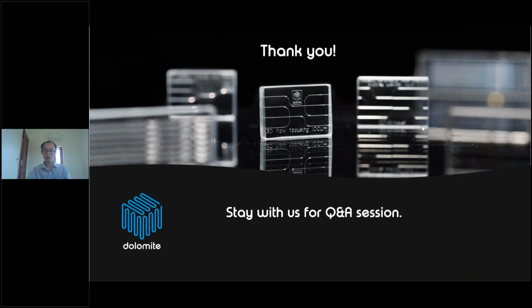Another last question I can see here is from Pretty as well. Can we control the temperature in the microfluidic process? Is this manual or can we input it in the system? Yes, we can control the temperature in the microfluidic process.